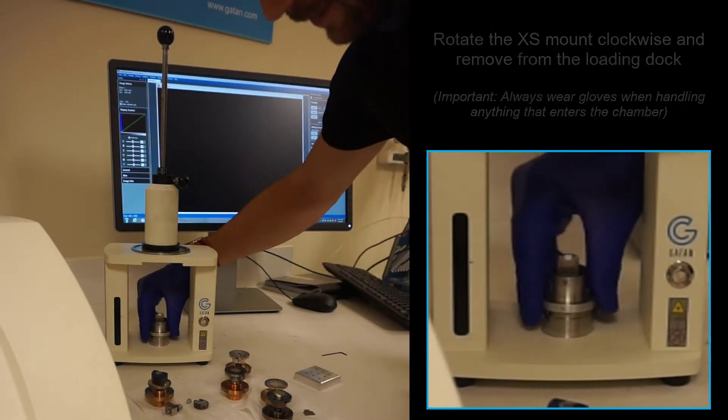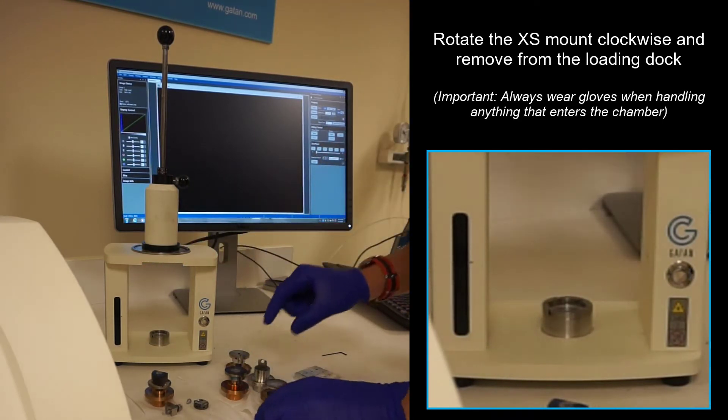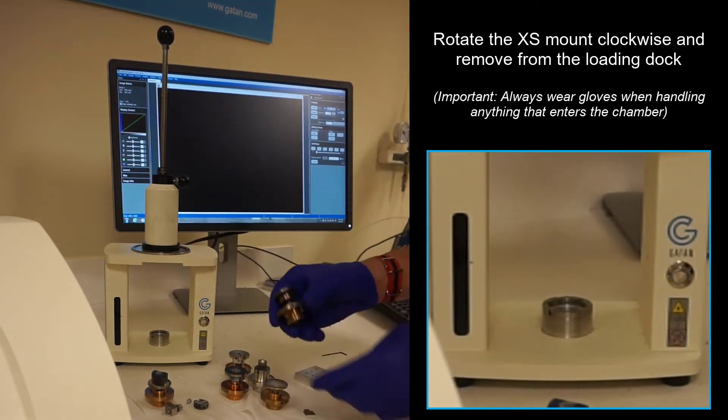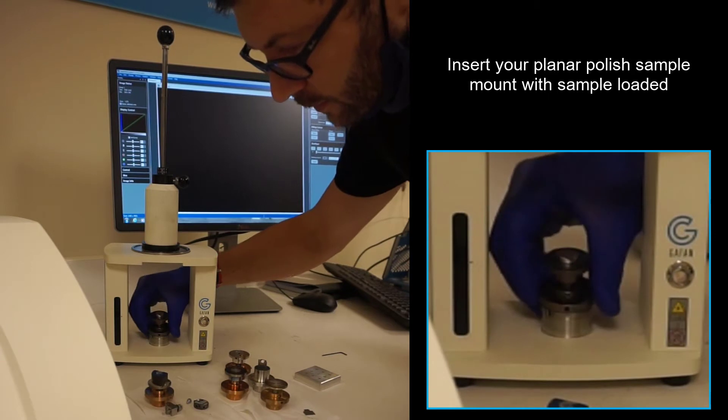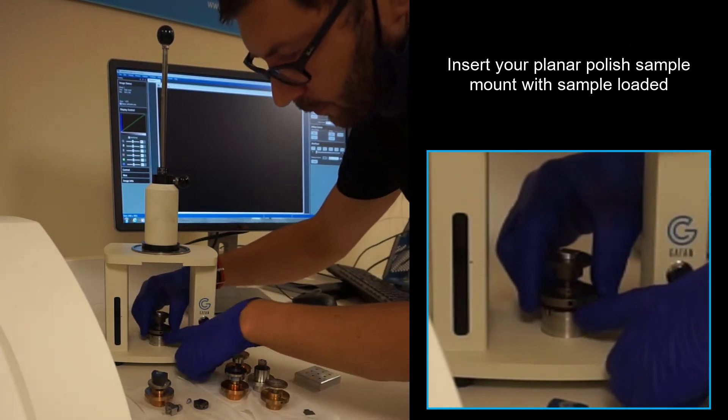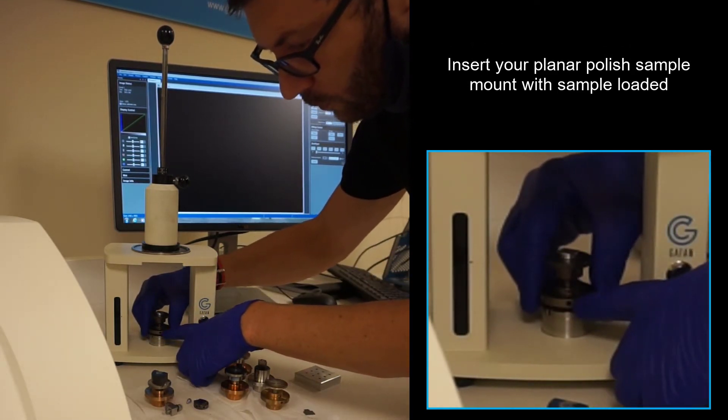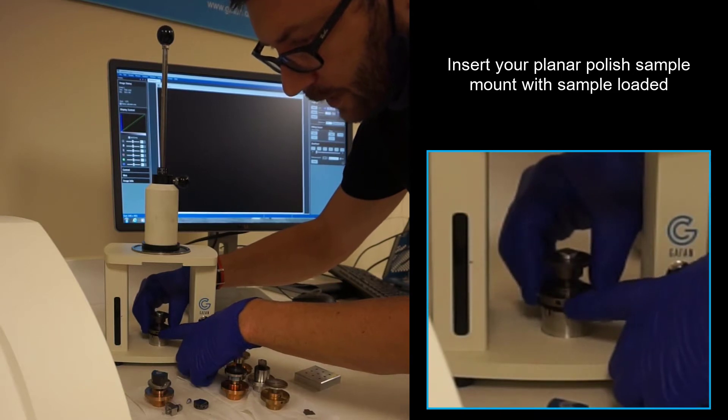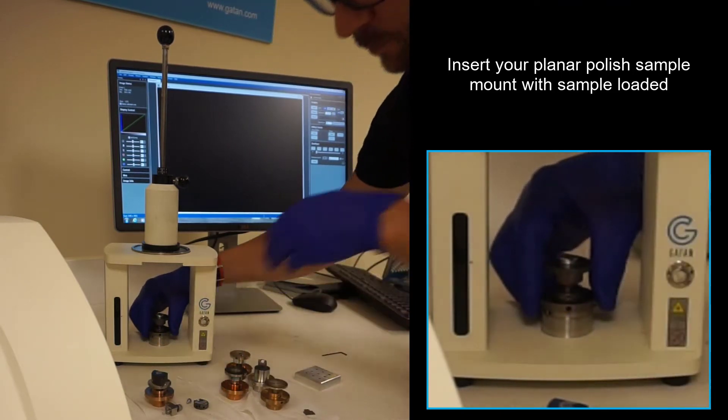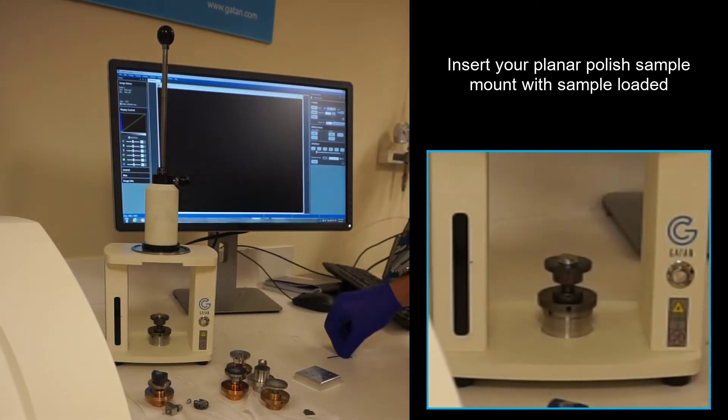Now that we're done aligning, I will put in my sample that I would like to polish. This little hole goes in the front, rotate until it falls in place, and then rotate back to zero.